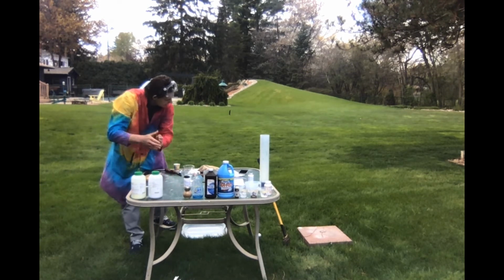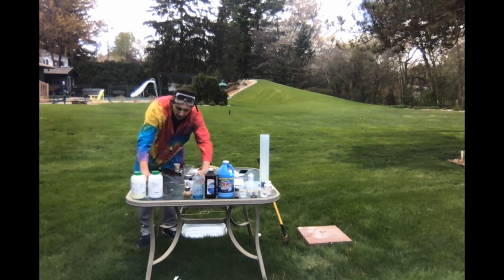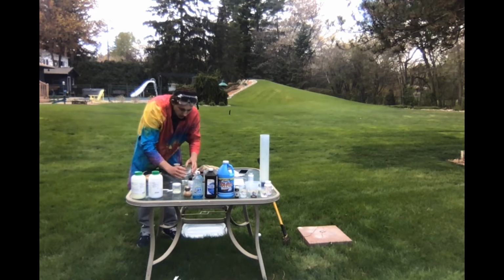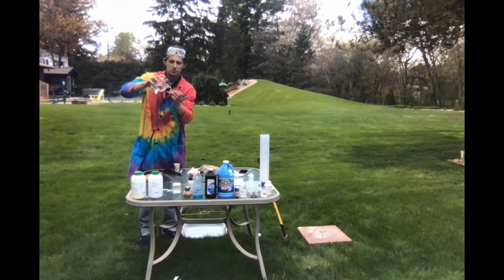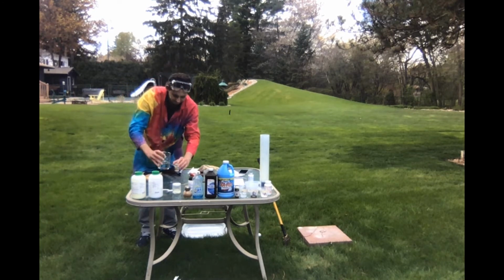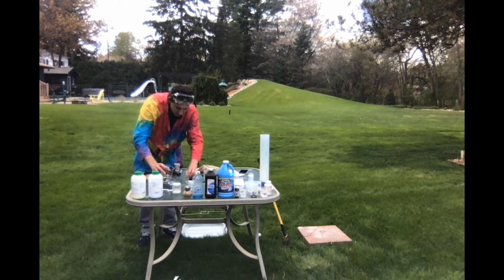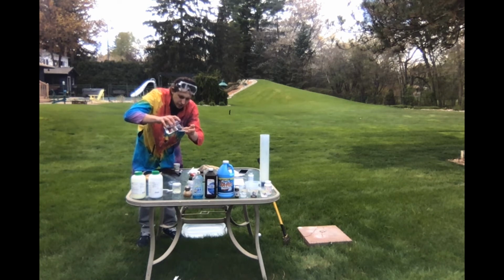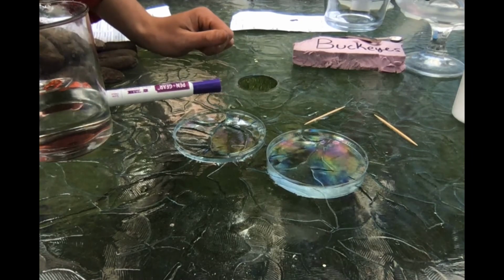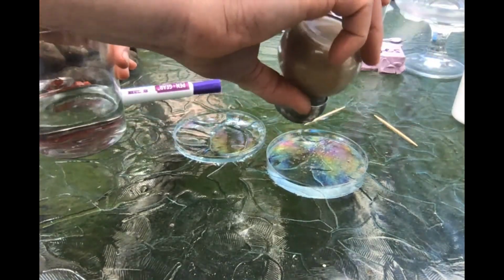All right, next one, wash your hands. Okay, here we go. I have water over here. This one's pretty easy. I just dropped that, gotta love it. Okay, water in that Petri dish, and water in this Petri dish. So we have just water in this. This is plain H2O. I'm going to put some pepper on this water.